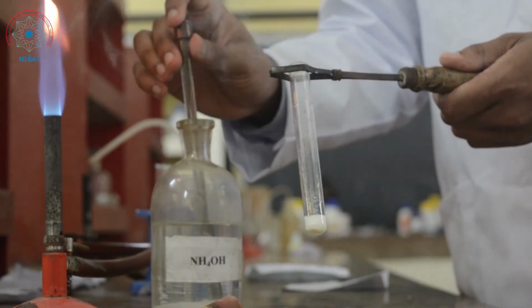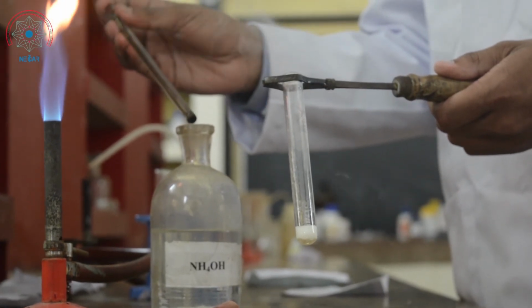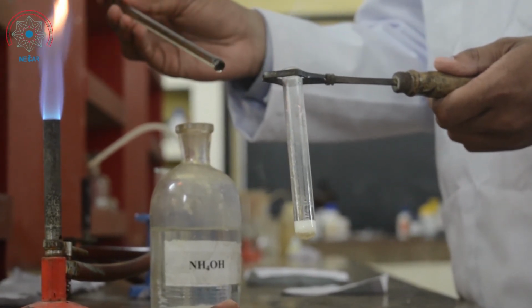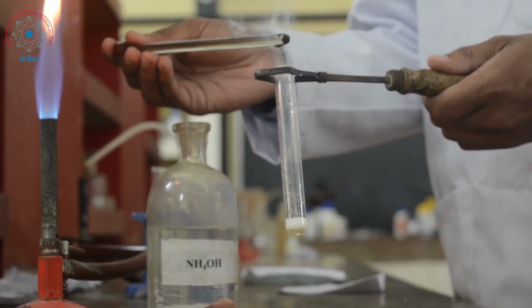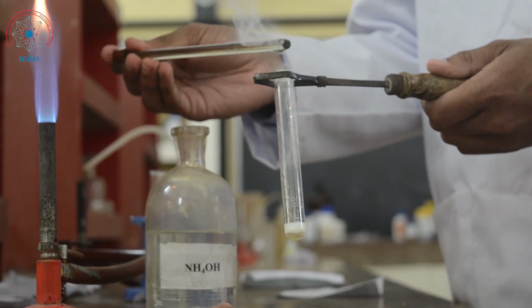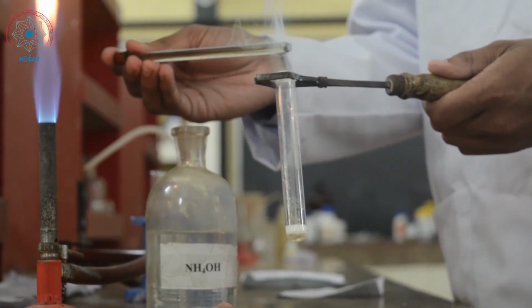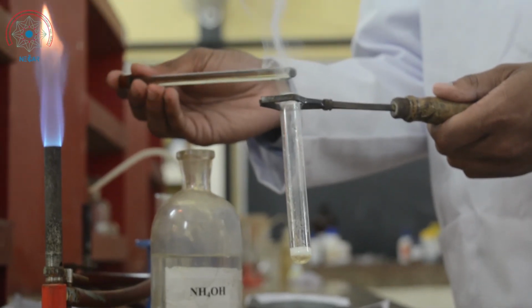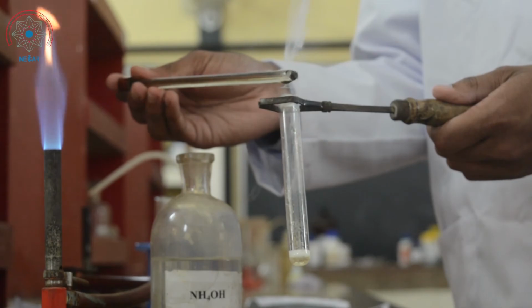While adding concentrated sulfuric acid, we observe some colorless fumes evolving from the test tube, which turn into dense white fumes when we bring a glass rod dipped in ammonium hydroxide solution near them. So this confirms that the salt contains chloride.